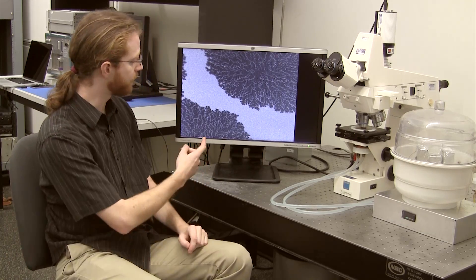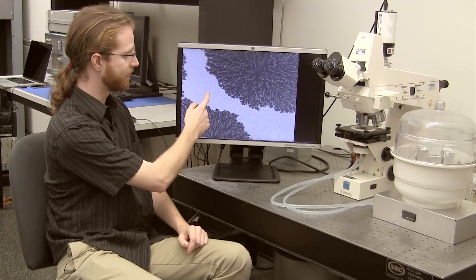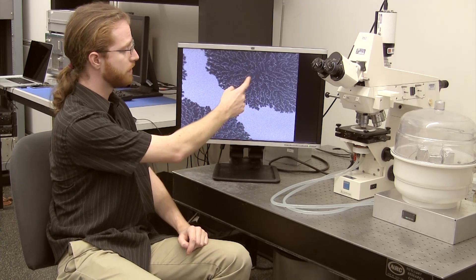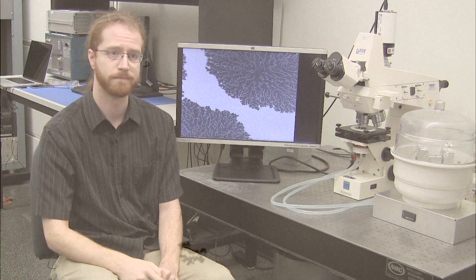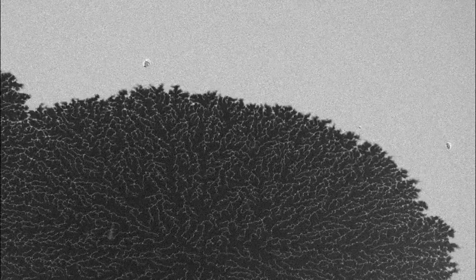This creates an image like this, where the light domain is magnetized upwards, and the dark region is magnetized downwards. Here, we start with the sample magnetized in one direction. If we apply a magnetic field in the opposite direction, we can cause the magnetization to begin to reverse. As we increase the field, this darker, reversed region grows.